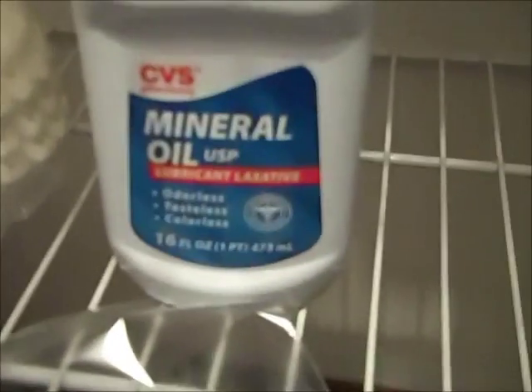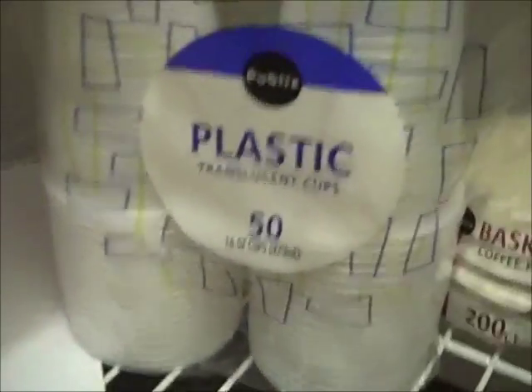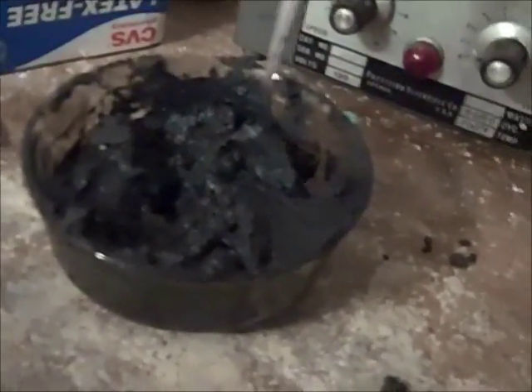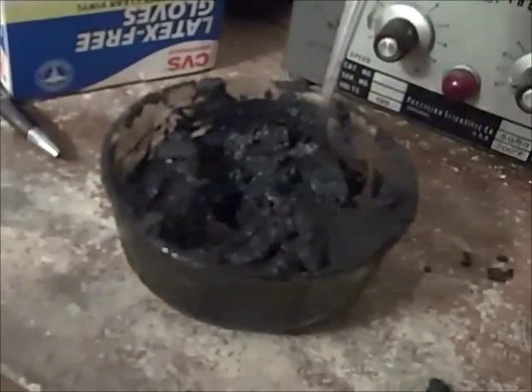Some other stuff I have in this area: coffee filters — get them from Publix, get the Wicon brand because they leave a cleaner filtrate — and some plastic translucent cups I got from Publix, being used as weighboats. I did not mention the manganese dioxide I got from a lantern battery along with the zinc and carbon. It comes with a large amount of manganese dioxide, about 500 grams worth in a lantern battery. I am in the process of trying to dry this mess after having washed it to get rid of some of the contaminants.